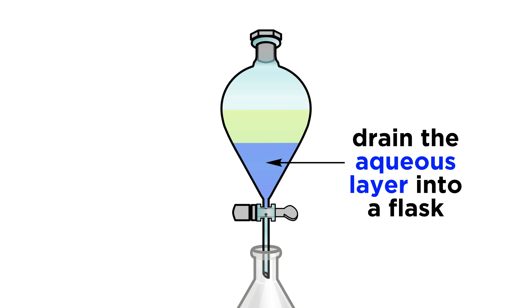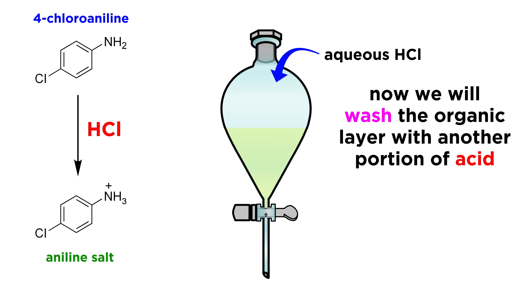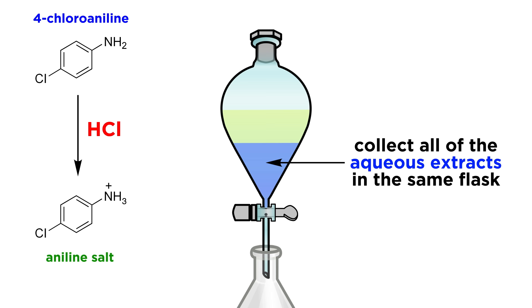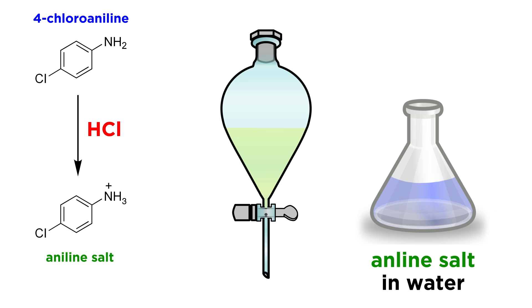Then just drain the aqueous layer into a new labeled flask. To be thorough, we will typically wash the organic layer again with another portion of the acid, and repeat the whole process, and then maybe even one more time with just deionized water, collecting all three aqueous extracts in the same flask. Now we've got our aniline salt sitting in water, and we can put it aside for a moment.